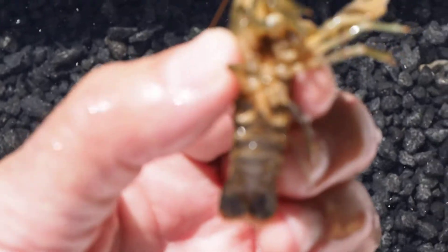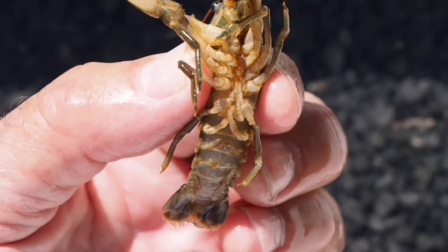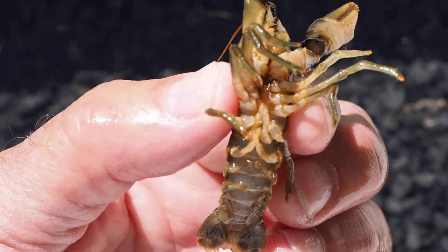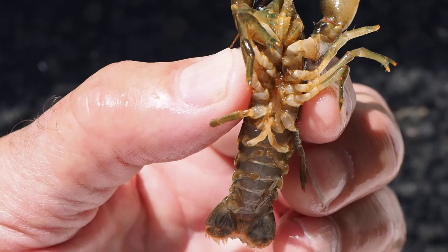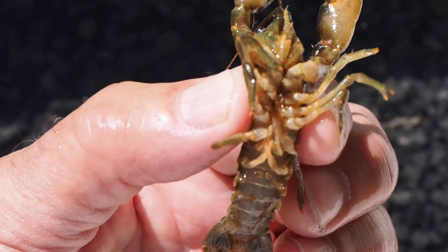And you can tell male from female. Let's take a look at this one — this is a male. It has larger swimmerets that go between the last few pairs of legs, extending forwards. That's for transferring sperm to the female. So females do not have that. I'll try to show you that as well, and I'll just put this one back in. So that's how you pick them up and how you tell it's a male.